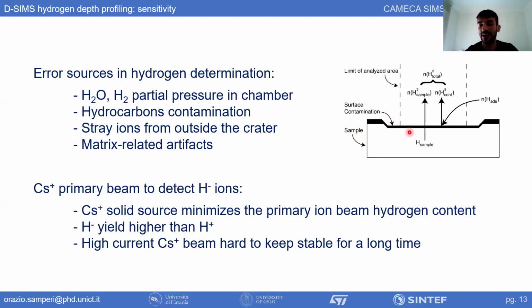This makes it really difficult to analyze low dose implants, I mean low concentration, because if the background is higher, it's probable that the noise is quite high and the detection limit is low.